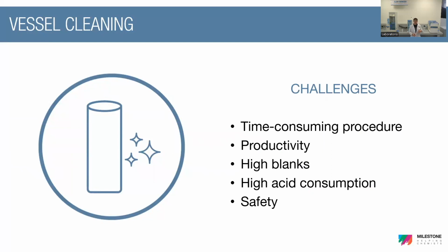If we think about the traditional soaking approach, using very large baths of acids with liter and liter of acids, or the recent approach of an increasing number of people using their microwave digestion platform even for cleaning of vessels, these approaches have some limitations, specifically regarding timing, since cleaning is usually a time-consuming step.